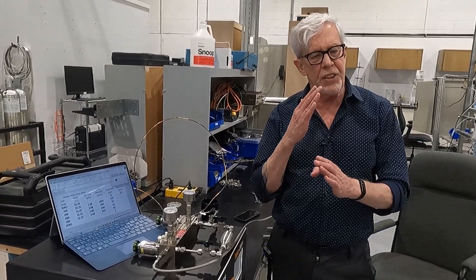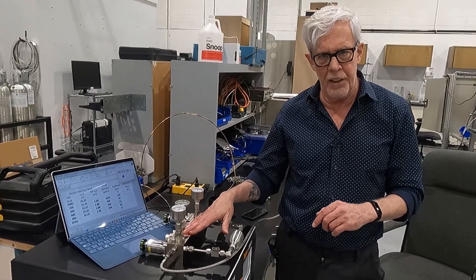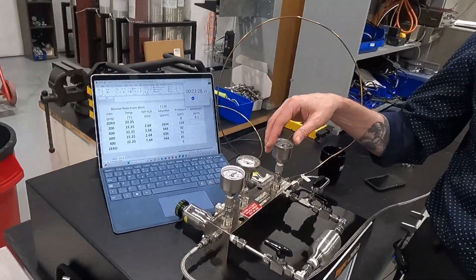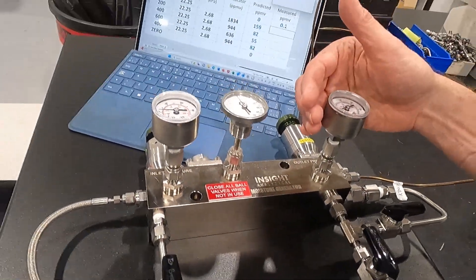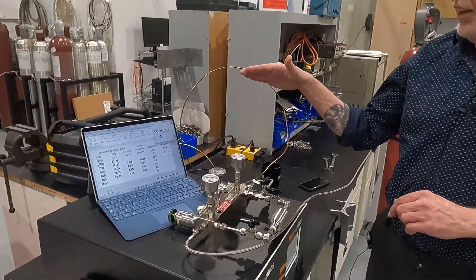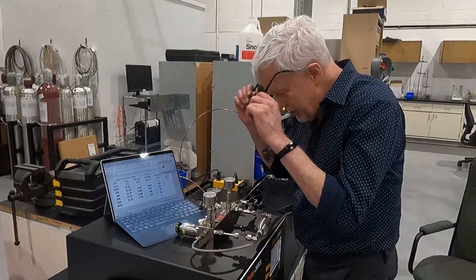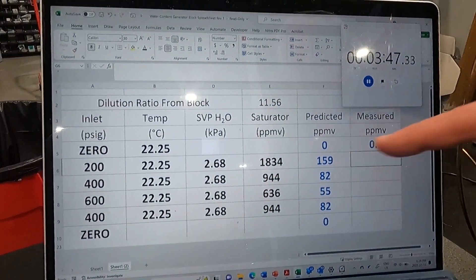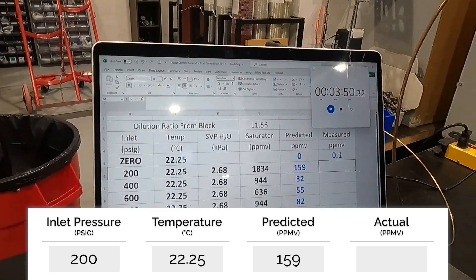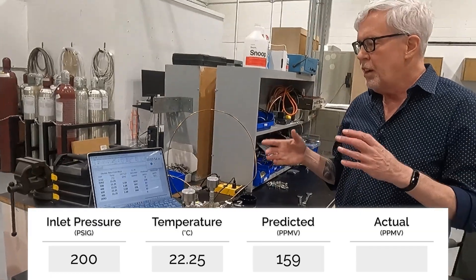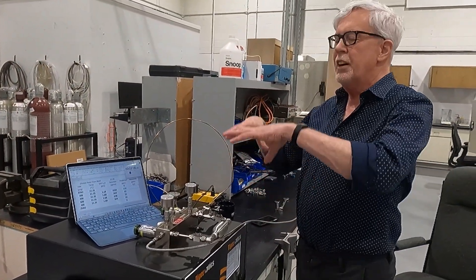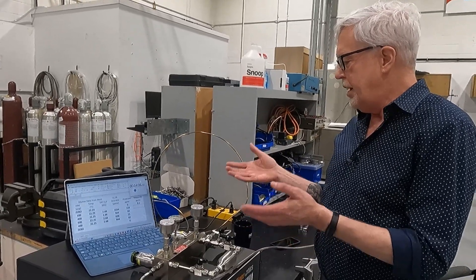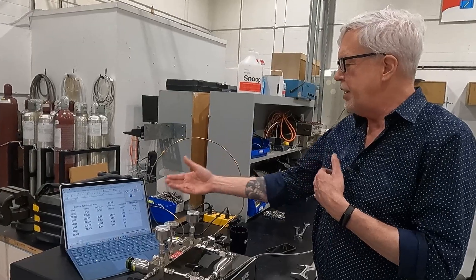The block generates a fixed dilution ratio. Every Insight Analytical moisture generator block is calibrated for a dilution ratio, and we print that on the side of the block and send a spreadsheet along with it to calculate the water content. At 200 psi gauge and 22 and a quarter degrees C, we expect to get about 159 parts per million. The analyzer will take a little bit of time to equilibrate through its T90, so we'll allow that time and then compare to the predicted concentrations.